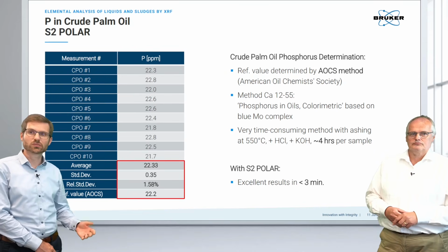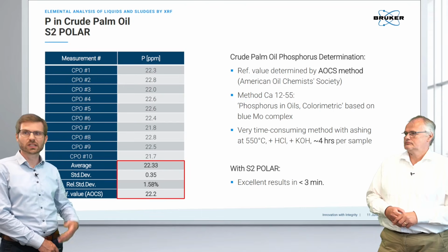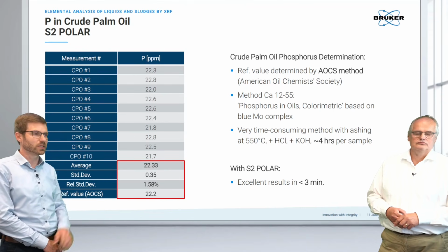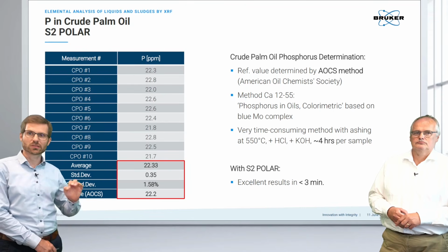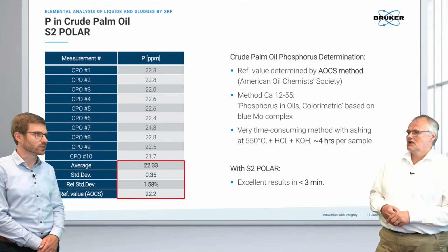Yeah, so we are really switching from something that is sort of process monitoring in a not very fine-grained way to something that is really at spot, at line, production monitoring with this tool.